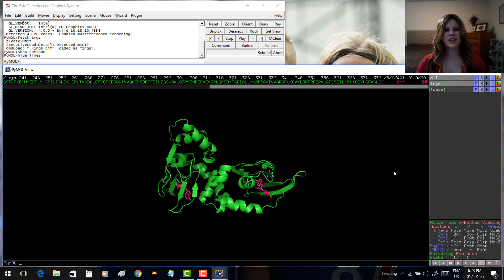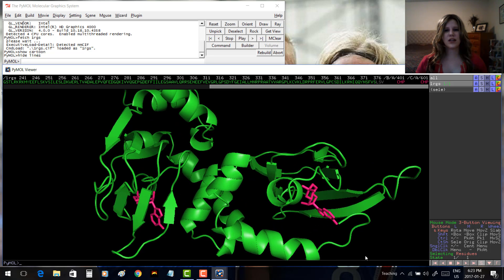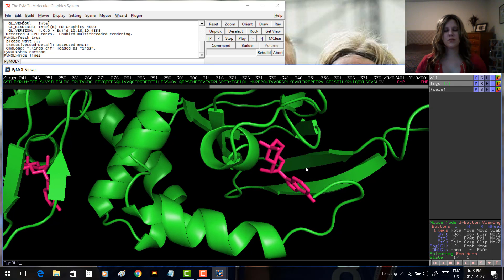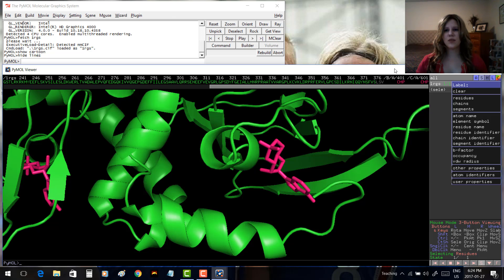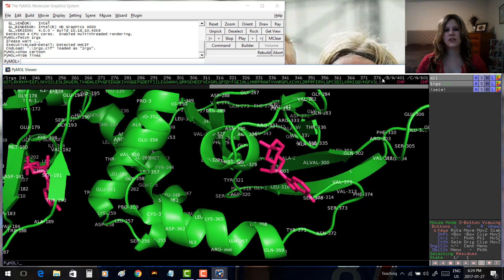Now let's say we're interested in looking at the residues nearby that ligand. Let's zoom in a bit so we can see one of our ligands and the residues around it. We'd like to see their names and numbers. The easiest way is to move over to 1RGS, click L for Label, and choose Residues. This gives us the name and number of each residue.